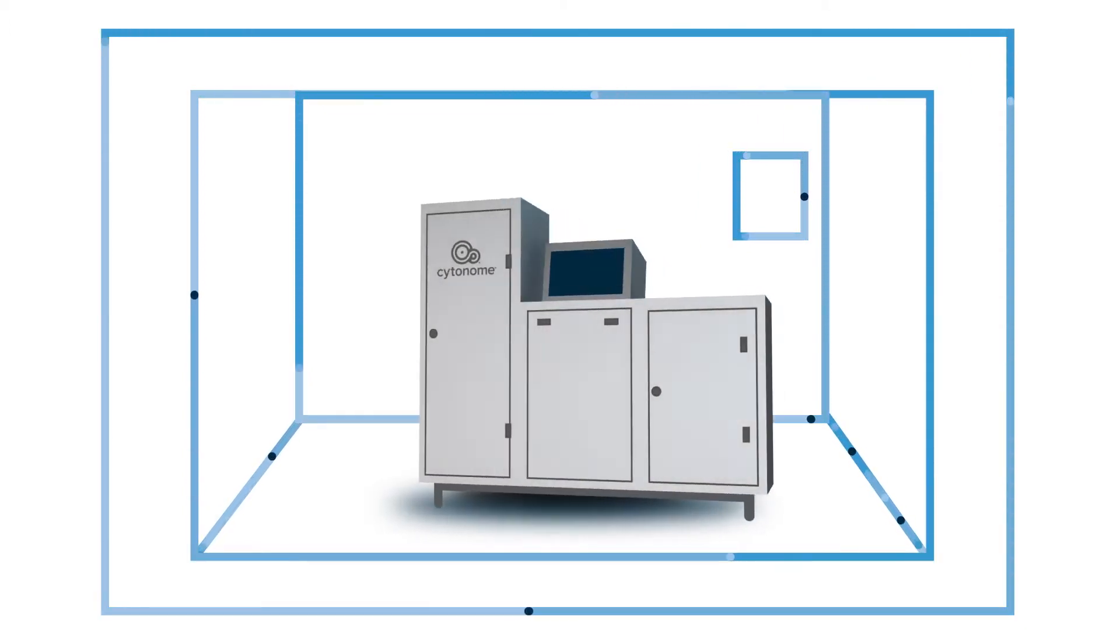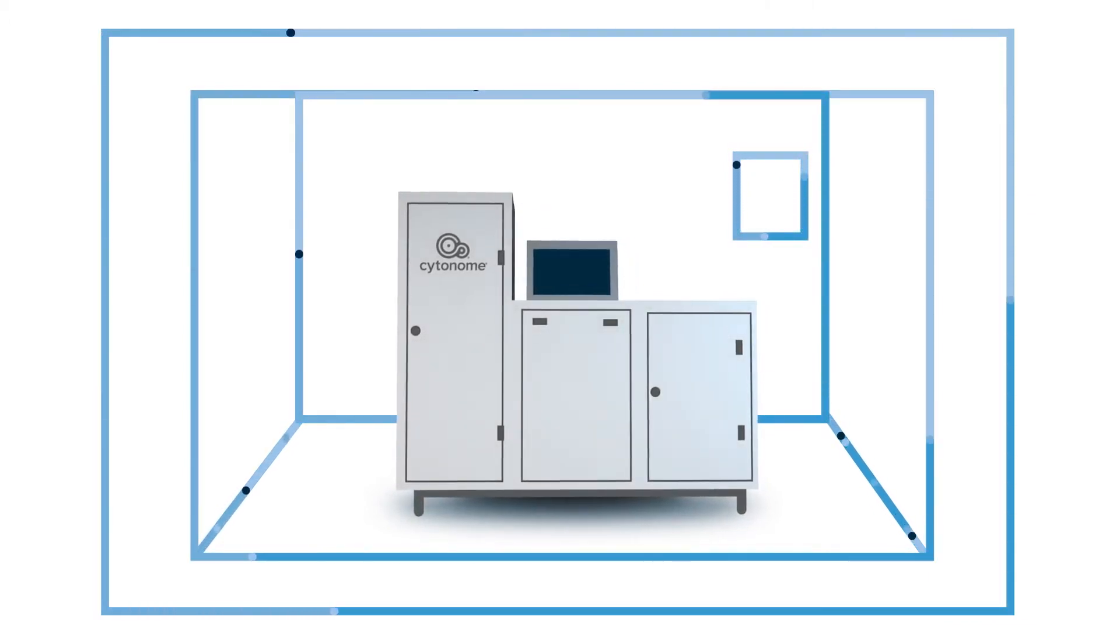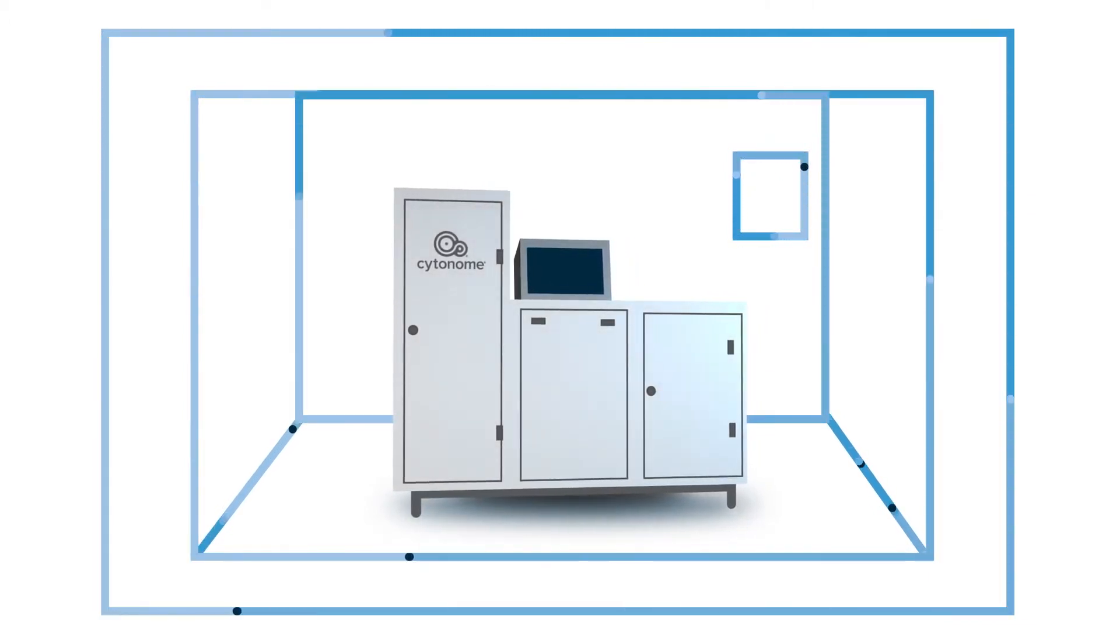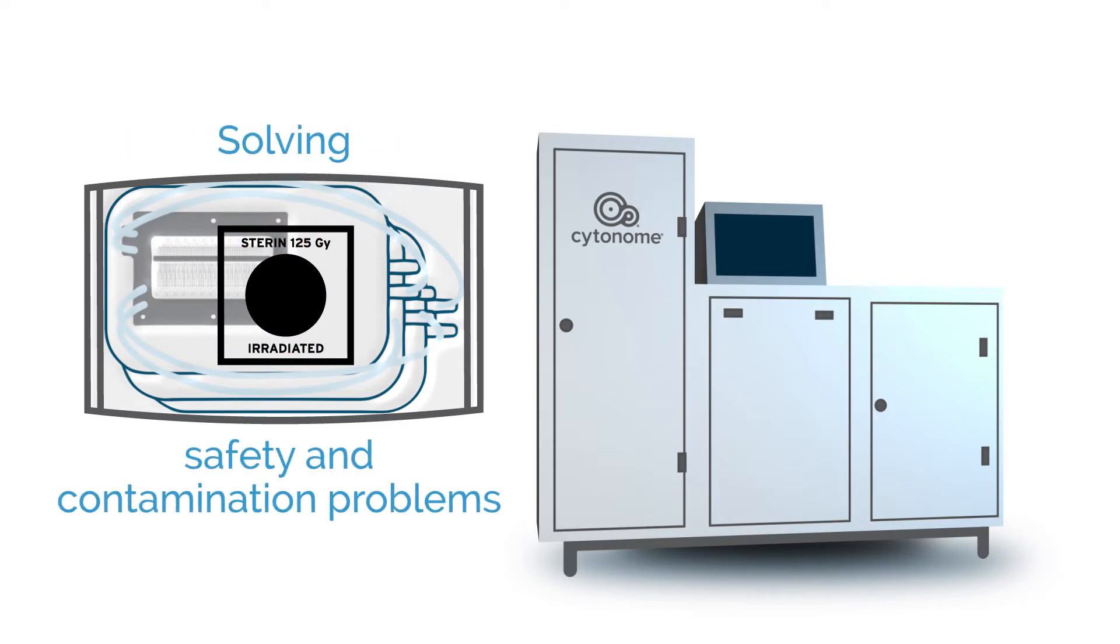The Cytonome GIGASORT is a high-throughput enclosed microfluidic cell sorting platform created for cell bioprocessing. The fully enclosed single-use fluidic set is gamma irradiated for sterility, solving safety and contamination problems that plague droplet sorting technologies.